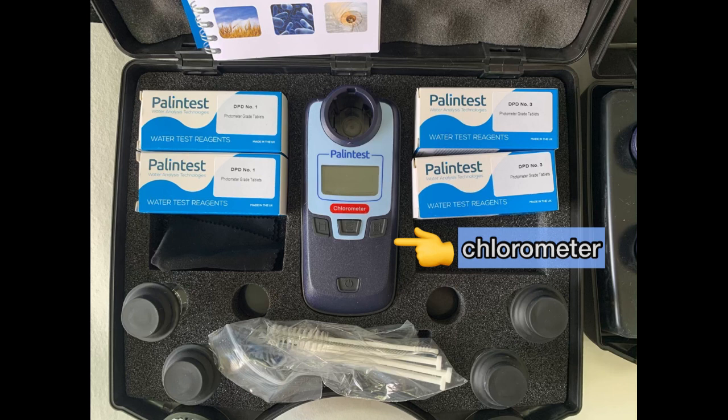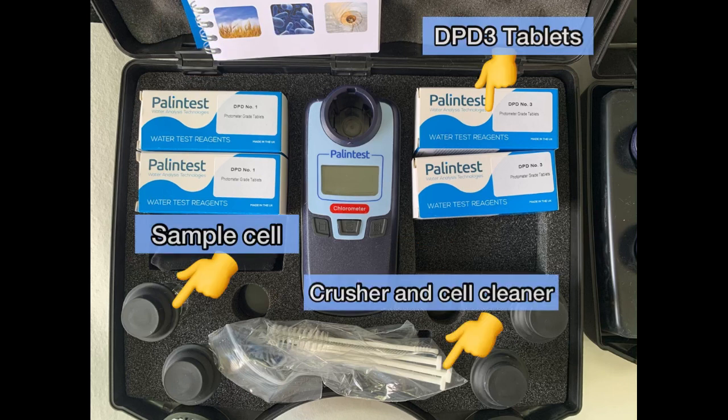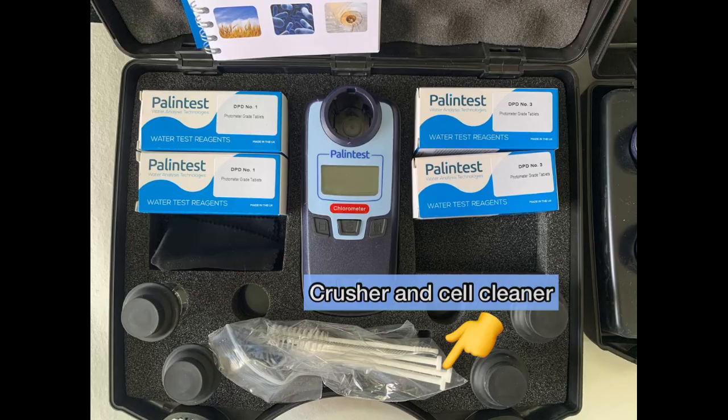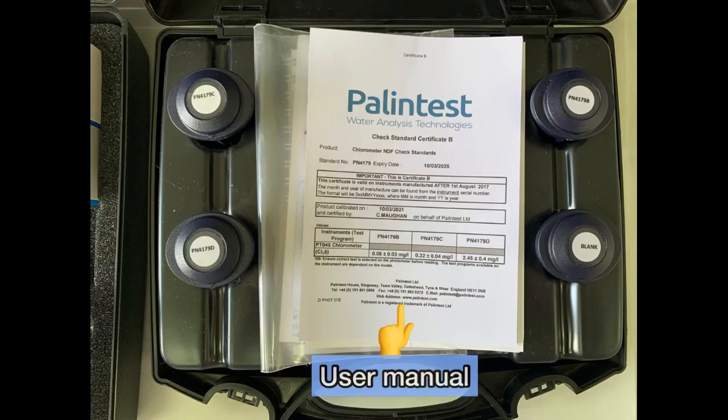In the Chlorometer case, you have the Chlorometer, DPD-1 tablet, DPD-3 tablet, sample cell, crusher, and cell cleaner. In the standard case, you have standards, blank, and user manual.